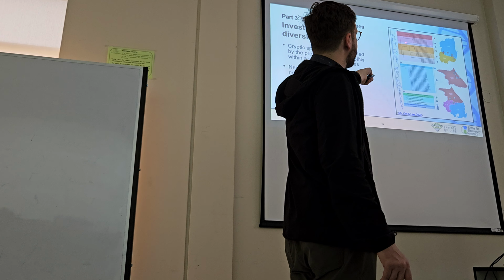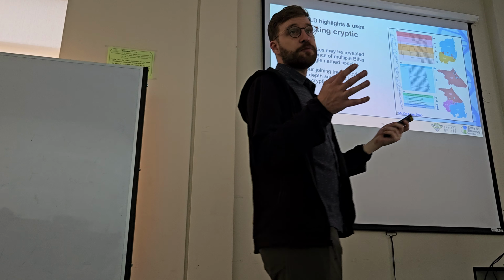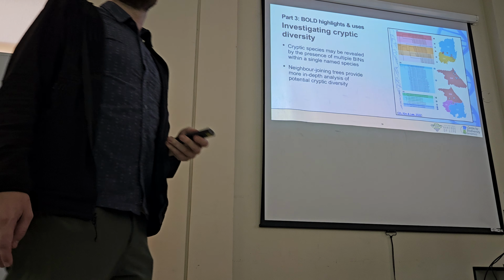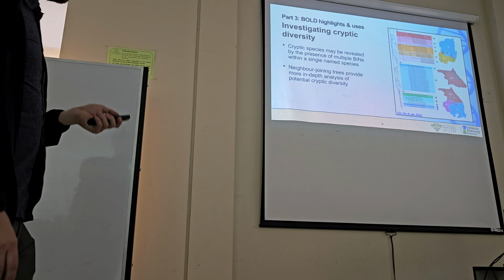So these ones in pink are all basically the same here, and these ones are all very similar. So each of these groups represents probably a different species. And so this one species that this group was studying actually turned out to be 1, 2, 3, 4, 5, 6, 7, 8, 9, 10, 11, 12, 13 maybe, right? So you can get your barcodes for your group across the landscape, put it on BOLD, and then BOLD turns one species into 13 bins. And so that's probably similar to 13 species.